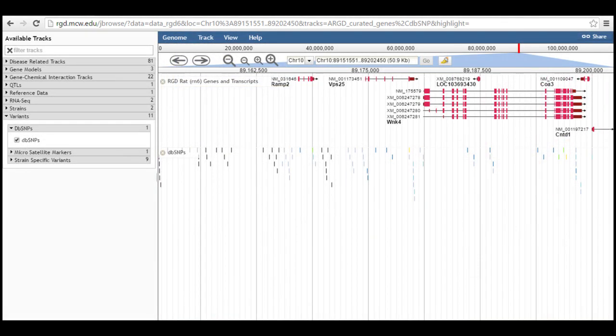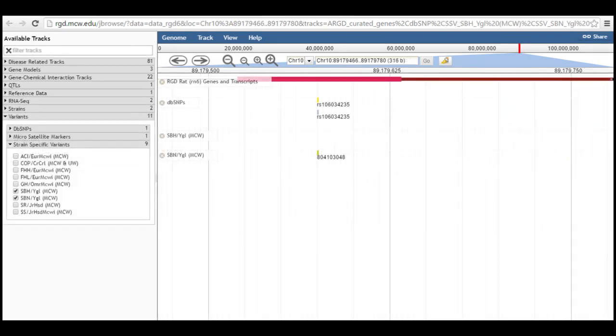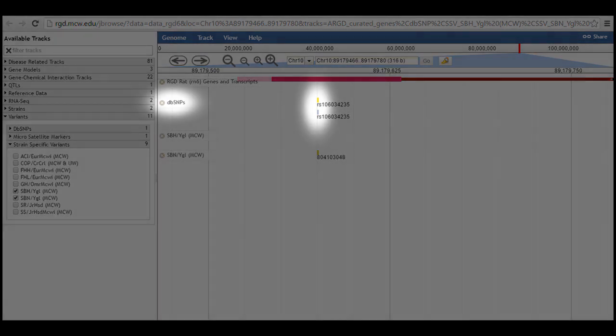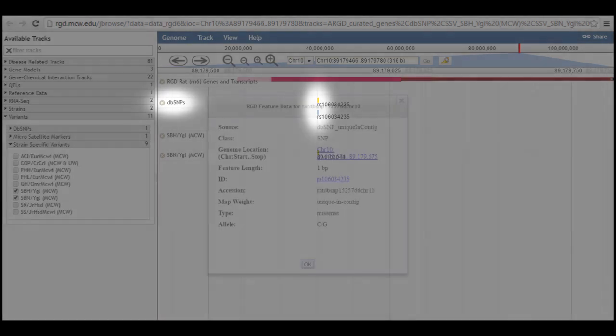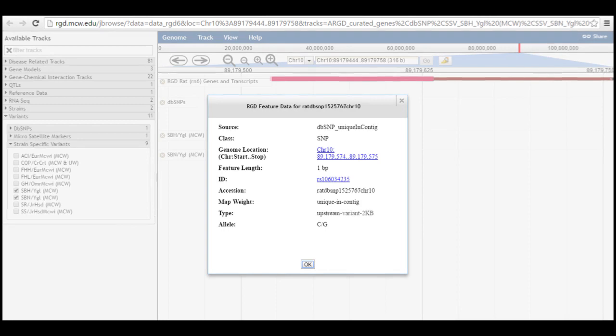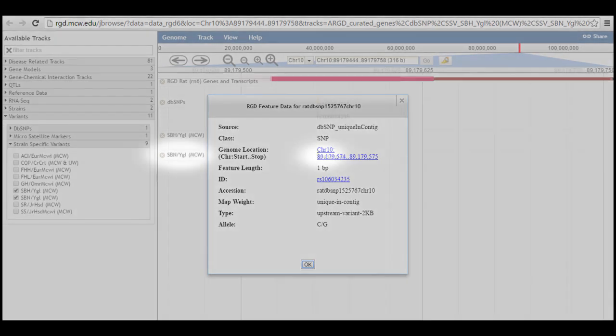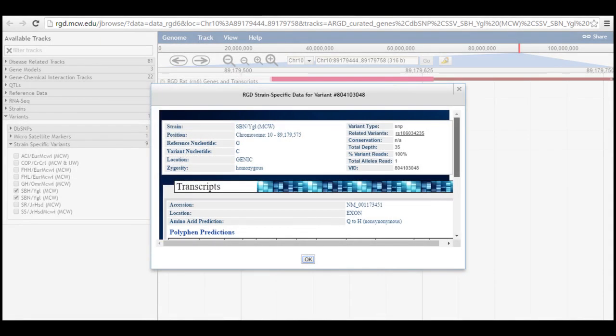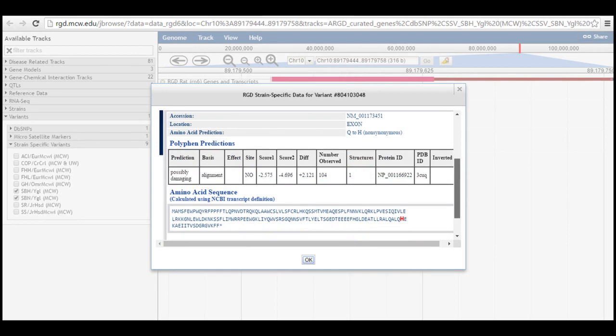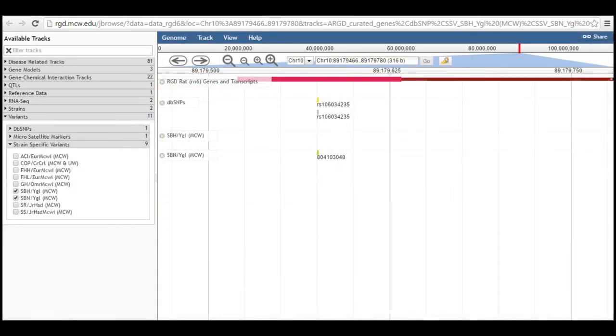Variant tracks can be viewed when the display is zoomed out. Zoom in to more easily see that the variant glyphs are color-coded according to the effect of the variant. In this case, the variant shown, which is found in DBSNP and in the SBNYGL strain but not in the SPHYGL, is colored yellow and blue in the DBSNP track to show that it is a missense variant in VPS25 and an upstream variant for WNK4 respectively. It's a mustard color in the SBN track showing that it is a non-synonymous variant predicted by polyphen to be possibly damaging. The pop-ups for the variants also show that the polymorphism changes in a G in the reference sequence to a C causing an amino acid change from glutamine to histidine.